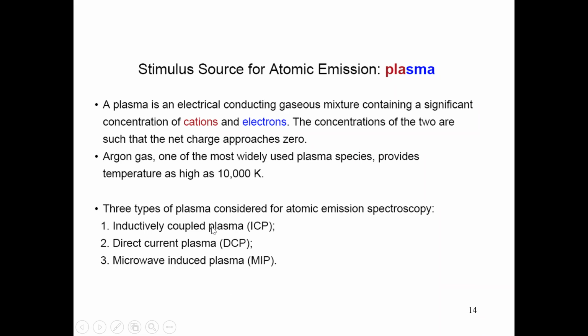So inductively coupled plasma happens to generate a higher temperature than the direct current plasma. Sometimes we need to see these to make an impact. Right now, I'm just talking about it theoretically.